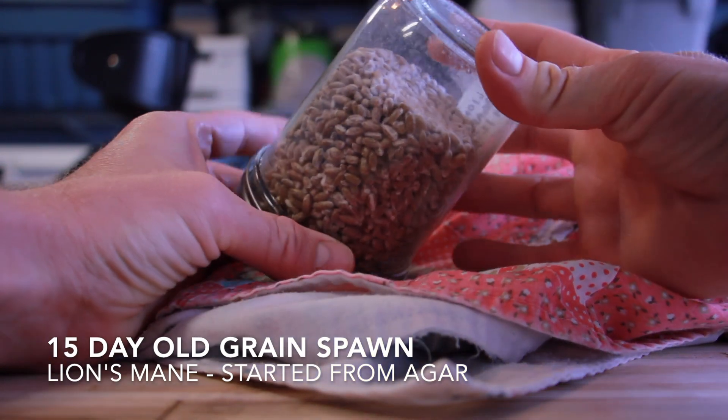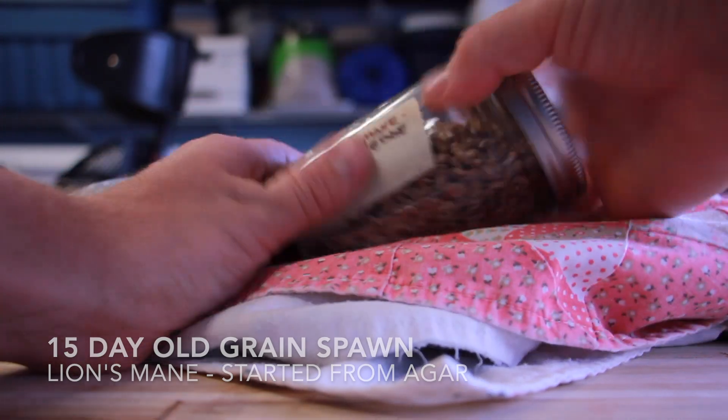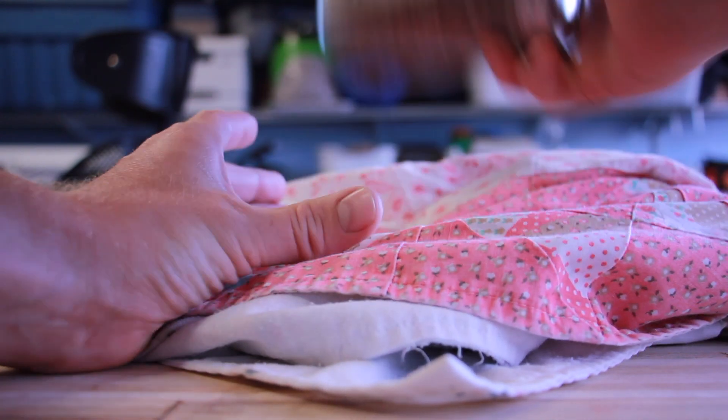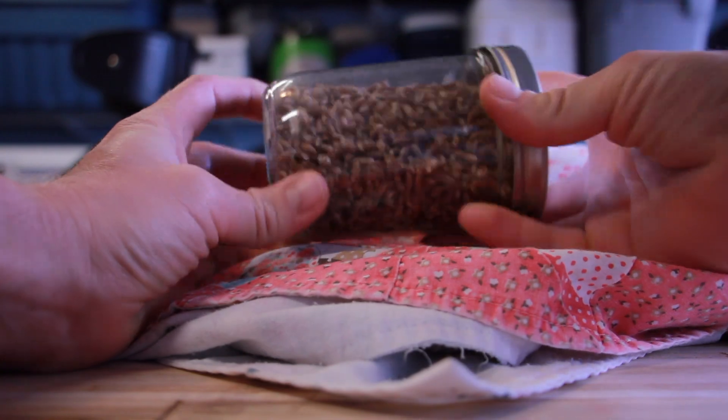The agar had some mycelium growing on it from lion's mane and over about 15 days it fully colonized the jar. It might not look like what we're used to seeing for a fully colonized jar - lion's mane is very wispy and very thin, so you kind of have to take a picture and zoom way in to be able to see all the mycelium. I assure you it is fully colonized. I gave it a good mix so there wouldn't be any big chunks in there, and then I transferred everything into my still air box.